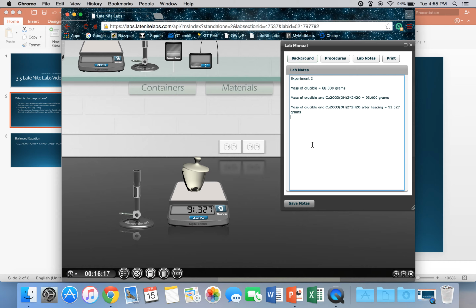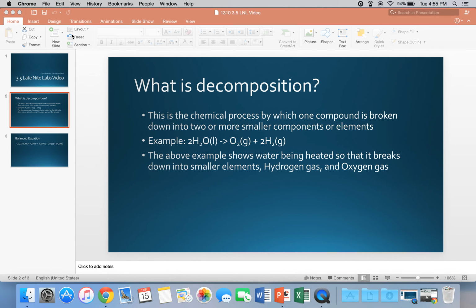This is consistent with our expectations for the experiment because H2O and CO2 broke off from the solid when they were transferred into gas form. This is the definition of decomposition.